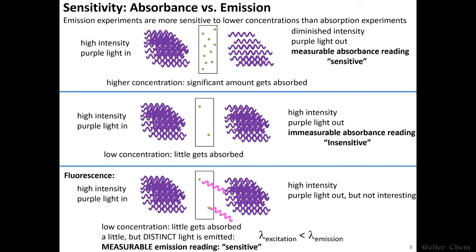Okay, in the last video we discussed why fluorescence is so sensitive. Now we're going to get into fluorescence experiments themselves. One aspect I want to discuss before we get too deep into things is that there are two lights to keep track of in these experiments, right? There's the light that we're sending in, some of which is coming out the other side, and then there's the fluorescence emission that we're actually trying to detect.